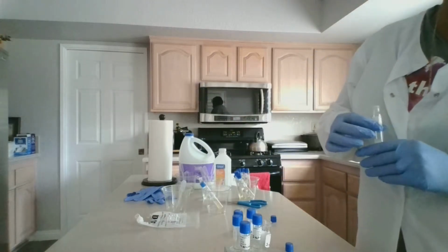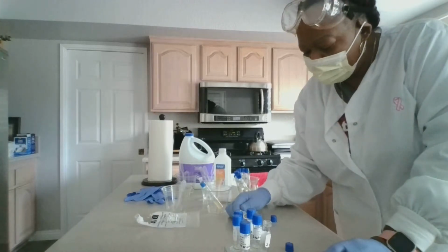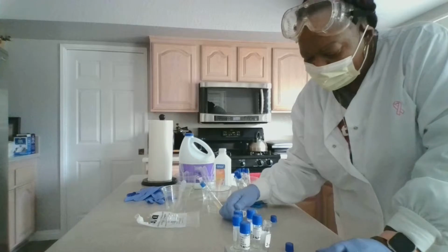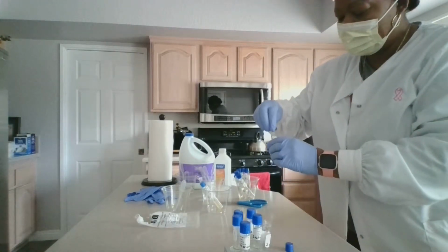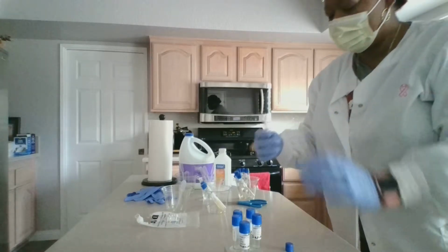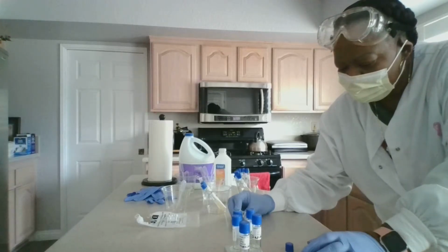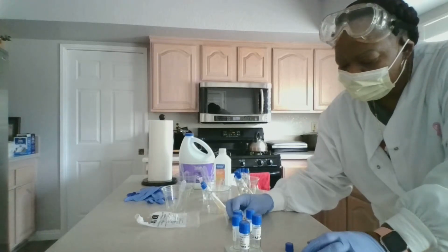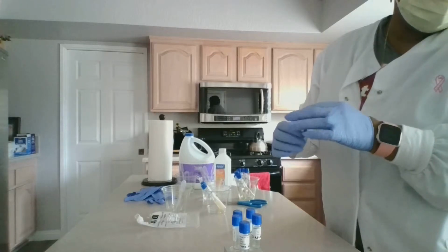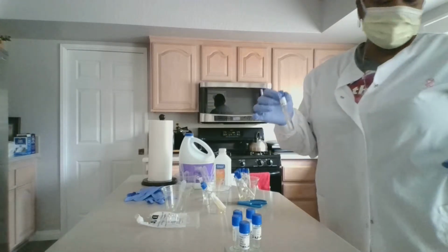Then I'm going to pass the opening of my active culture through the flames for sterilization, and I'm going to replace the lid on it. And I'm going to pass this one through the flames for sterilization, and replace the lid on this as well. And I'm going to go ahead and put this in my incubation location for 48 hours.